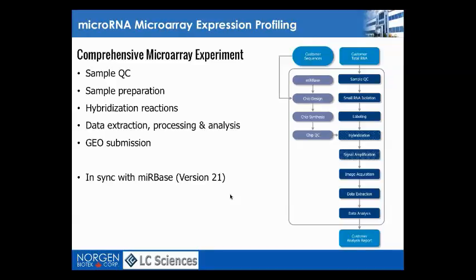And typically, once you publish it, you're required to submit the data to GEO or a similar database where they are publicly available. And of course, we help our customers with that as well. Then, as mentioned, you need to know the microRNAs in the case of the microarrays, so it's important to always have the latest miRBase version probe content on your chips. There are different chip manufacturers and different services out there. Just pay attention to the miRBase version because there can be quite some differences.